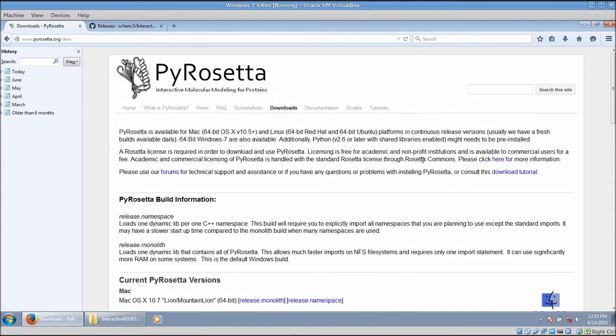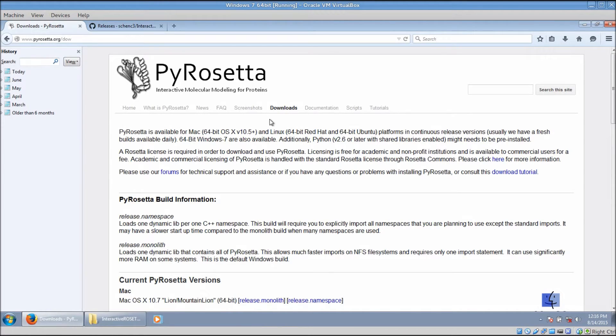This is the PyRosetta main download page. The link for this website is in the video description. You need to get a license from Rosetta Commons before you can download PyRosetta.